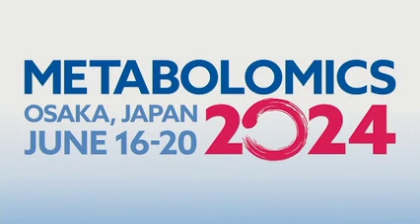Well, I'm thinking we had at some point an import module for MZtab format, right? So you could import the feature list from MZtab, which was created by another software. Is it still there in MZmine 4? No, we're just updating this with MZmine 3. We made some changes to the data structures, and going forward, we want to support it again, from the MZtab format.